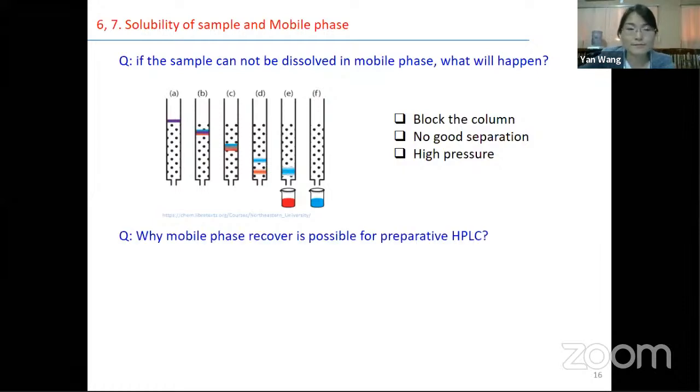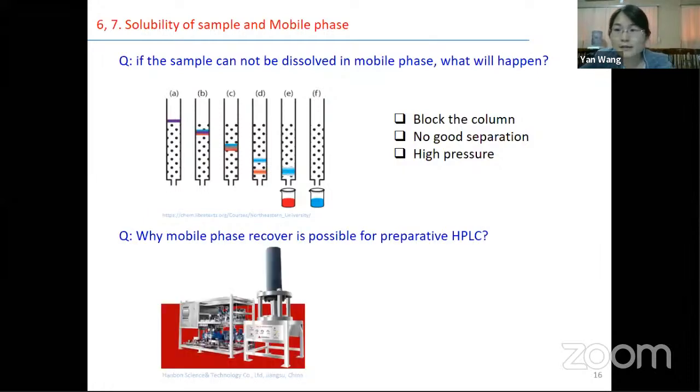And then for the large scale of preparative HPLC, they are using liters of solvent, maybe 10 liters, 20 liters, several hundred liters per day. And these are HPLC grade solvents, as Dr. Shaki already explained a lot. Those are very expensive solvents, and a huge quantity will be used.